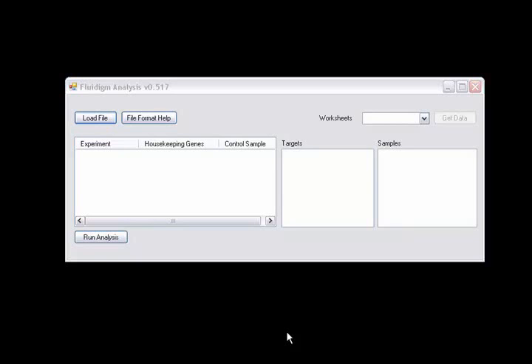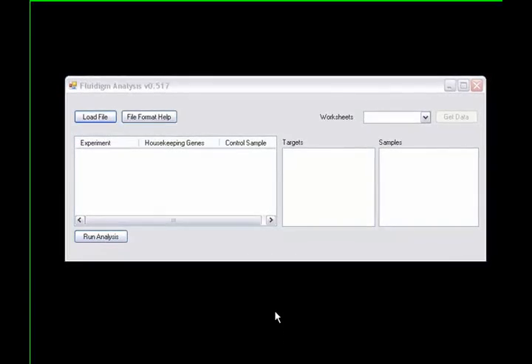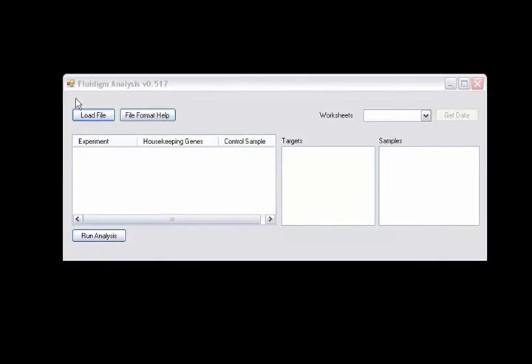Welcome to the automated QPCR analysis tutorial. After starting the program, click on the load file button.